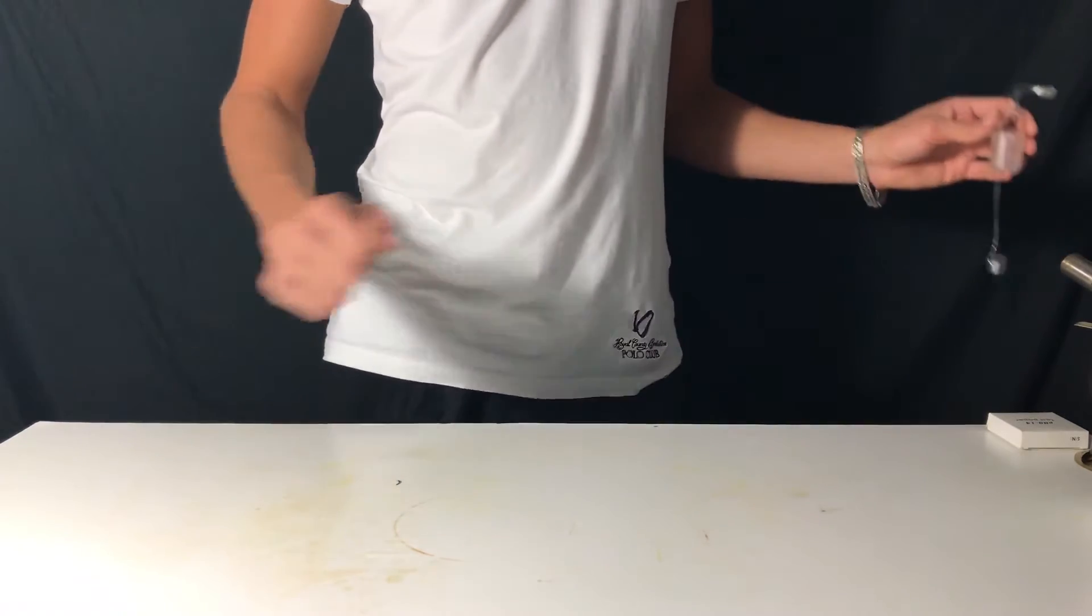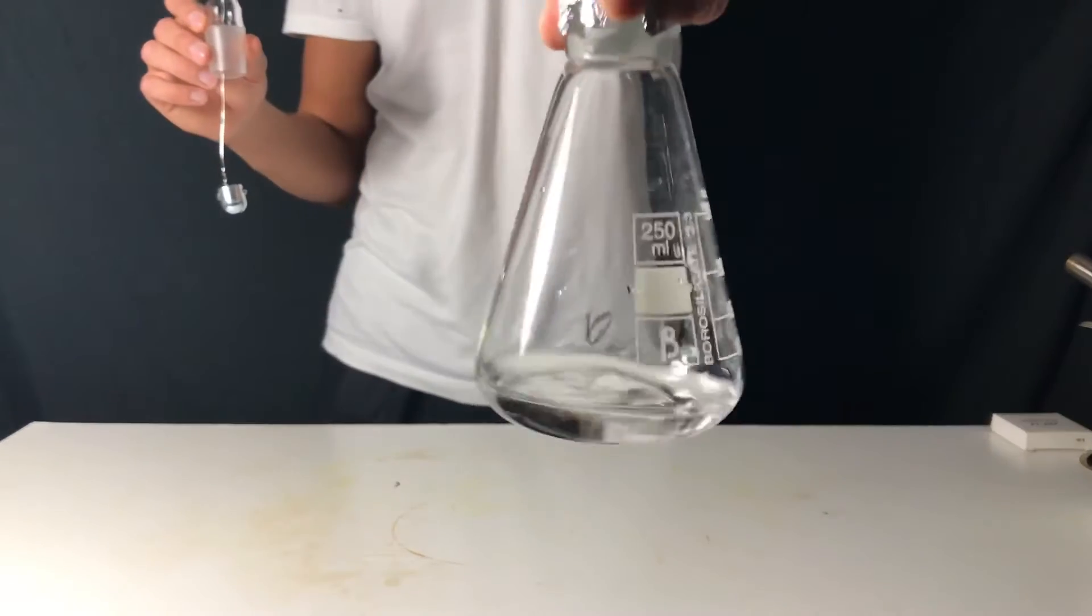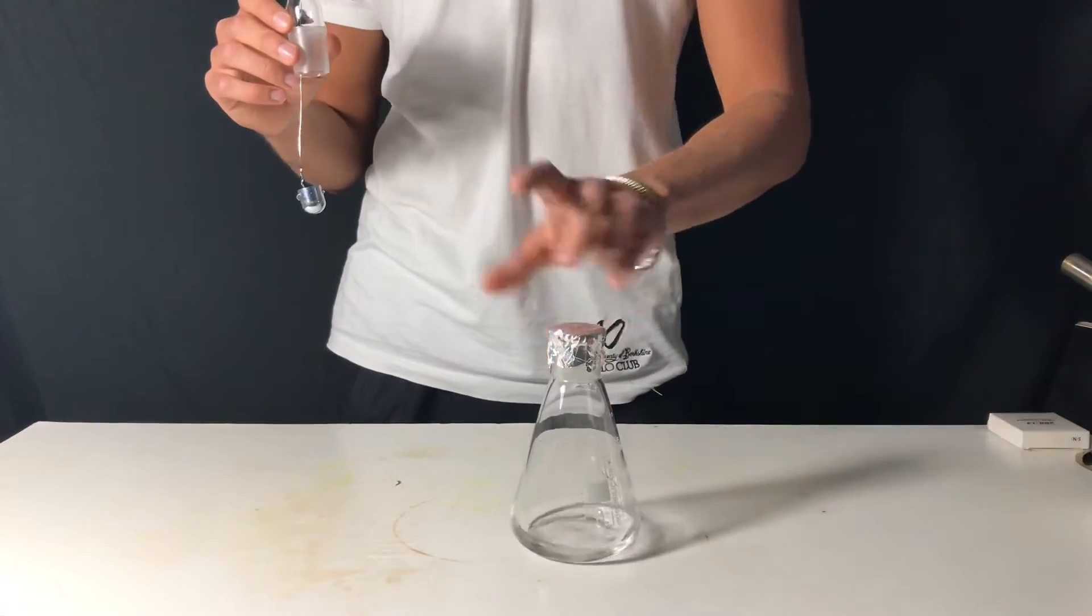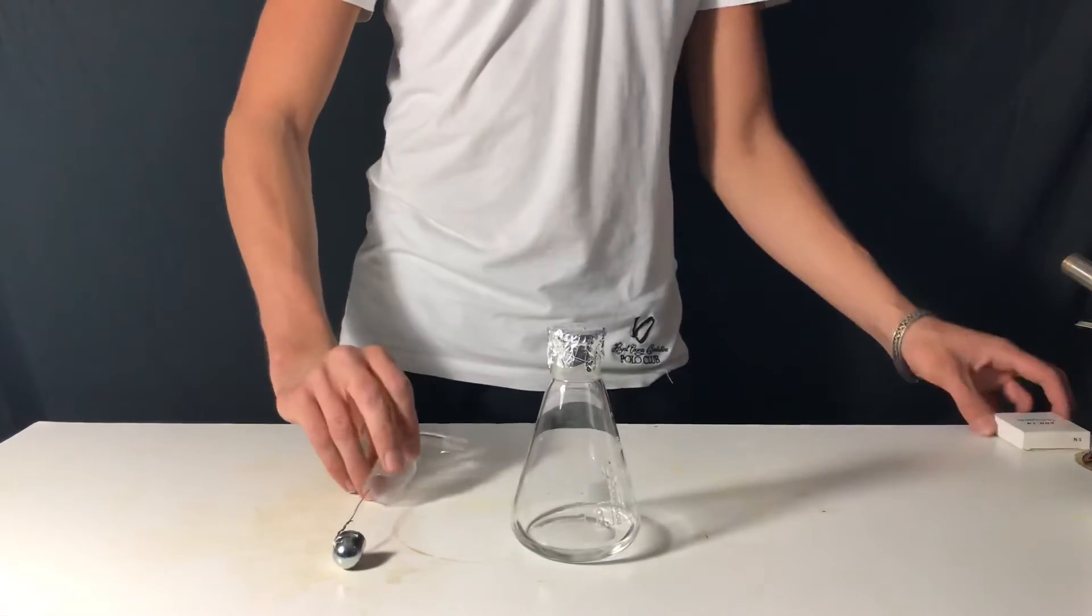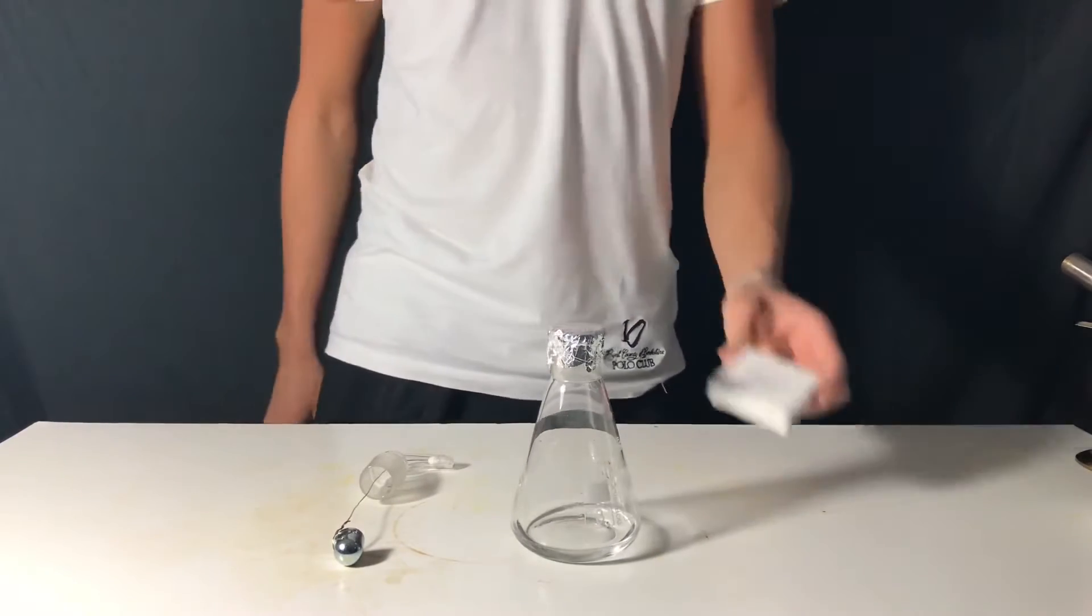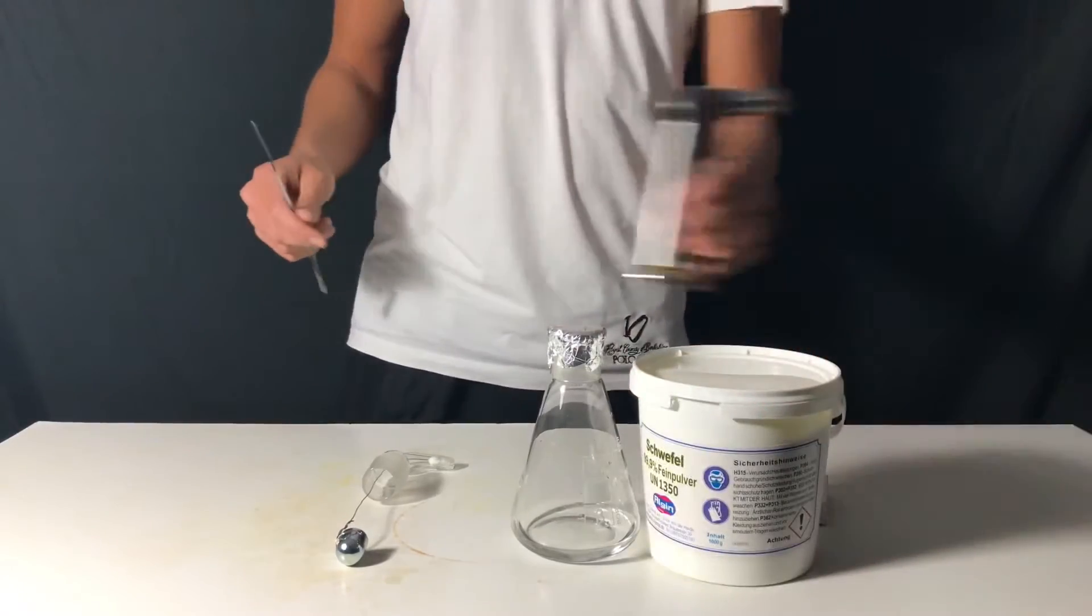For this experiment you are going to need some sort of burning dish connected to a glass adapter, a flask filled with water and oxygen and the adapter should go down all the way to the bottom, pH paper, a spatula, and sulfur.